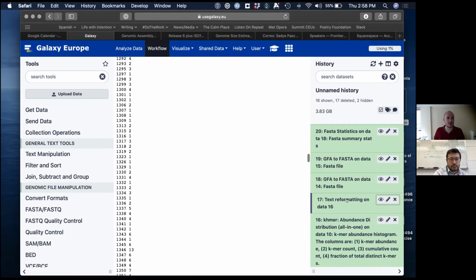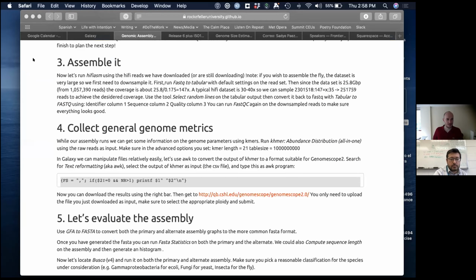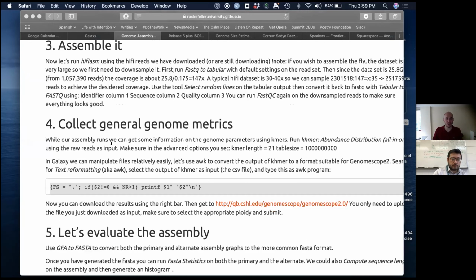Say it, please. Go to the first one, the AWK or the exercises? Yeah. So here, if you remember how the first file is formatted, we have comma separated rows. FS tells AWK to consider the comma as a separator for columns. If you play with Excel a lot, for instance, you do that all the time. When you import the file, maybe you have to tell Excel which separator you have. So here it is the same principle.